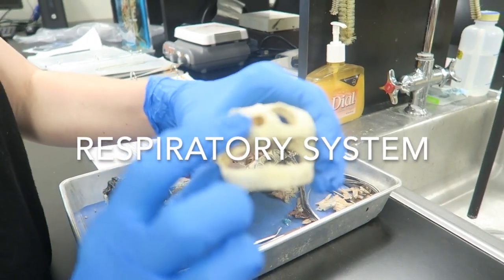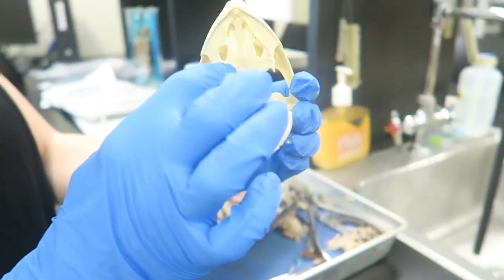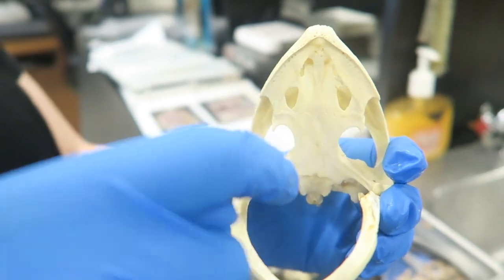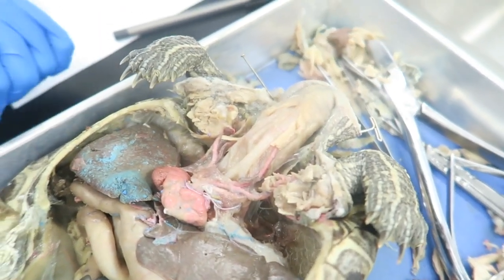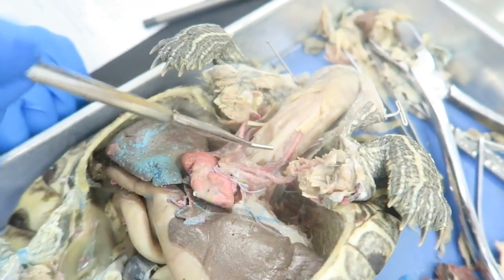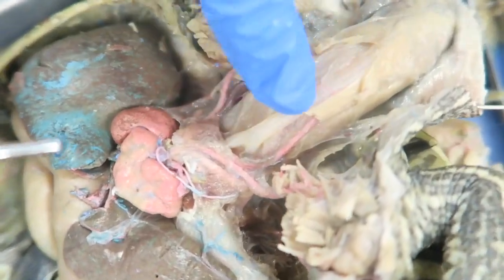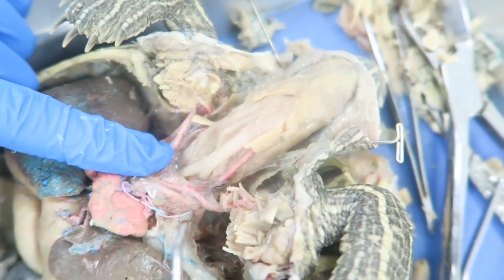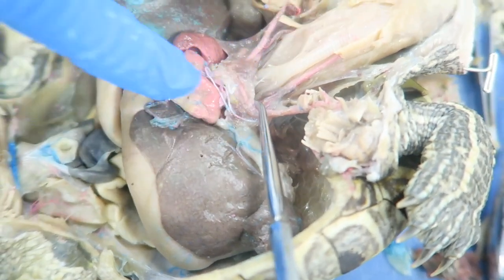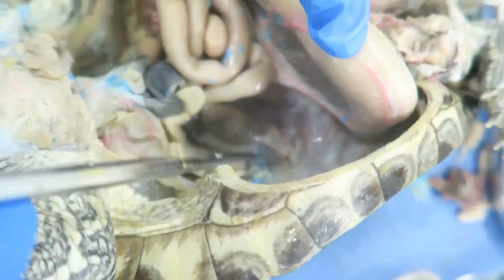During respiration, turtles breathe in air through their external nares. The air then goes through their nasal passageway and into the mouth, and then two palatal folds direct the air towards the glottis. The glottis connects the pharynx with the larynx, which then connects to the trachea. The trachea and larynx are both made of cartilage, and the trachea has a ribbed appearance that helps keep it from collapsing. The air then flows into the two bronchi and then into the lungs.